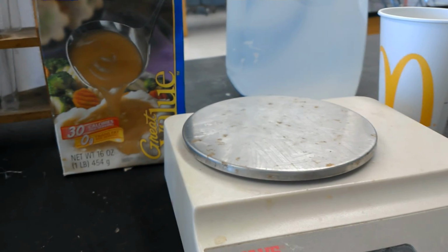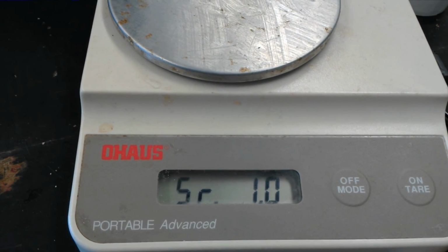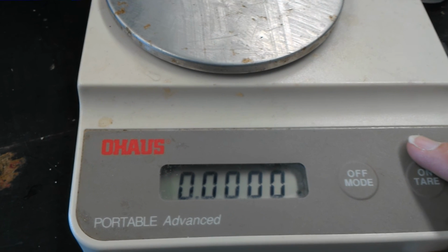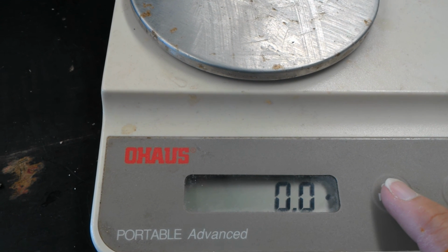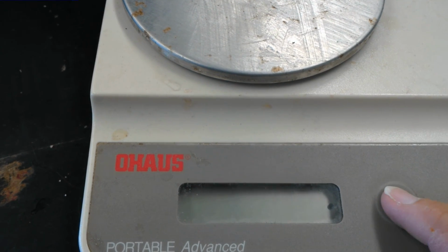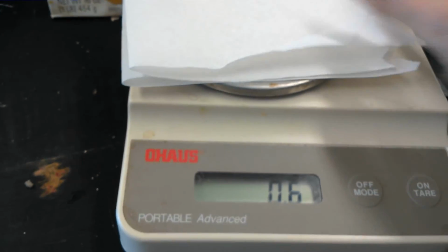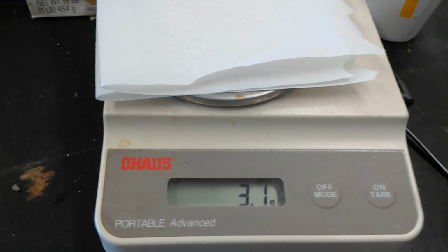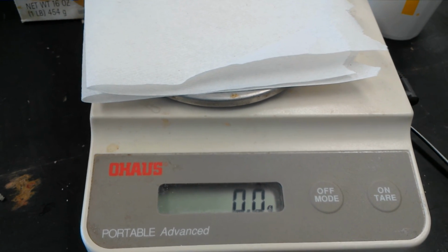Then you will come over to the electronic balance and make sure it's turned on. It's getting itself figured out. Remember, this is a process called taring. And you wait till it gets to 0.0. Let me get this in the right mode. Oops, I zipped right past it. We'll know it's in the right mode because it will have grams there. And it'll say 0.0. And then you're going to take a little paper towel and you're going to fold it up and put it on top of the plate. And it's going to say that it's 3.1 grams. We don't want that. So we are going to push the tare button, and it's going to zero out again.